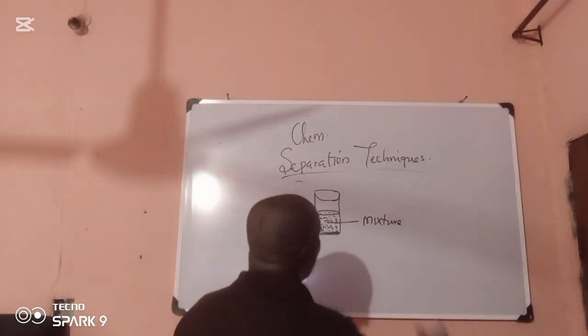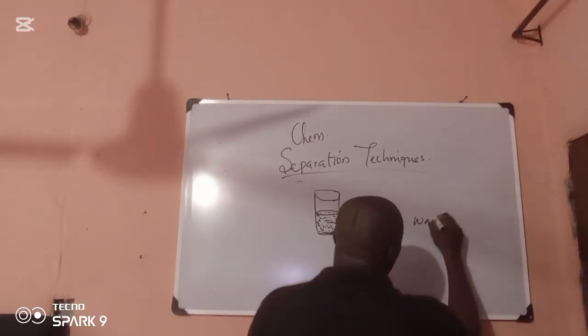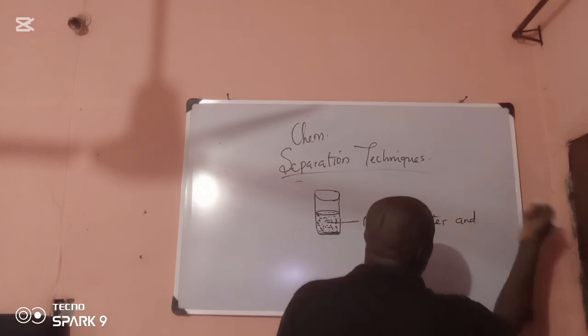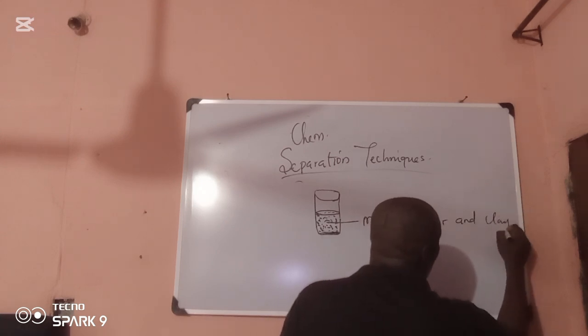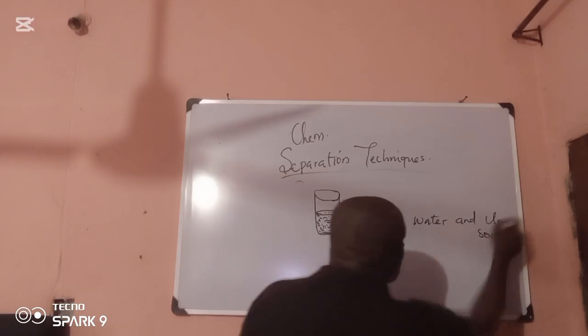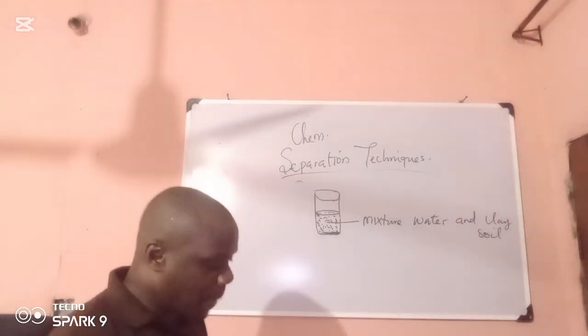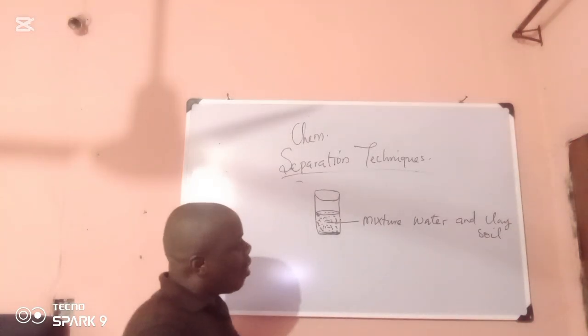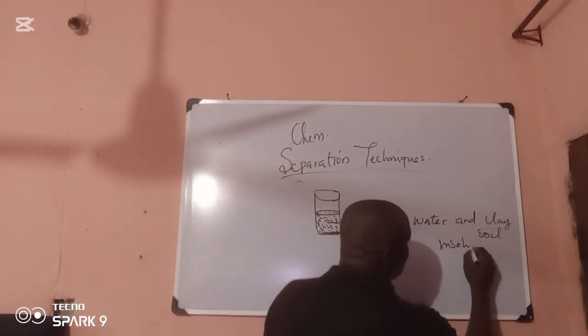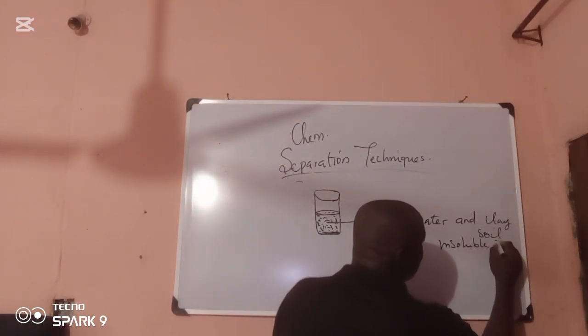After leaving it for a period of time, this is the mixture of water and, let's say, clay soil or some insoluble particles. Let's take insoluble particles.